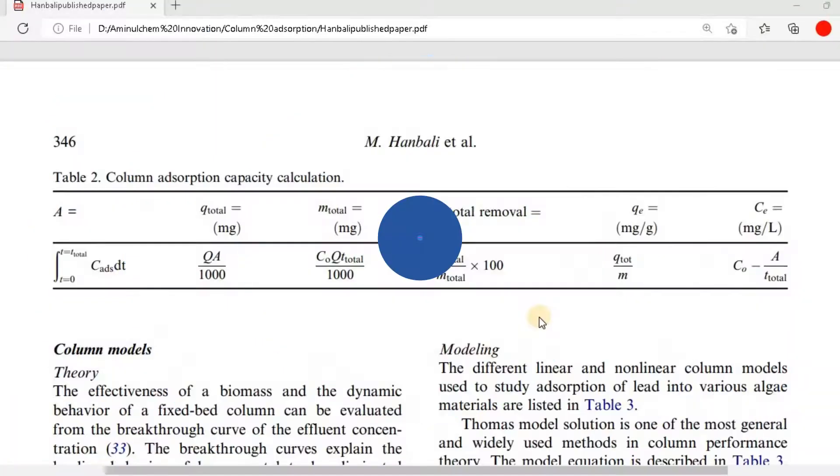In my previous videos, I showed how to determine various parameters for column adsorption, where I mentioned Q total equal to QA divided by 1000, where A is the area underneath breakthrough curve.